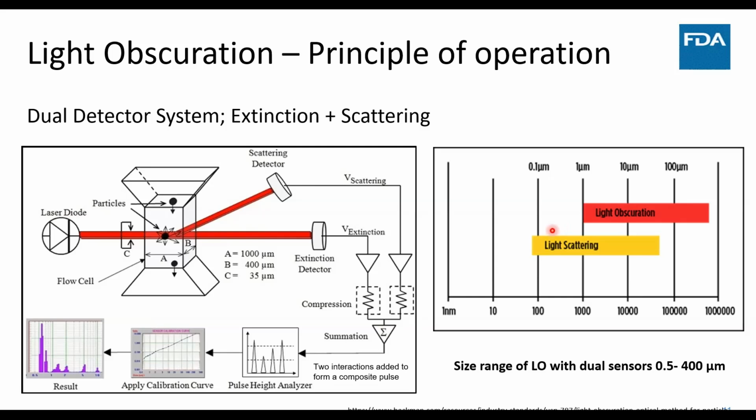Before we move on to the next slide, I want us to take a minute and really look at the configuration of the instrument and think about what could really go wrong with the instrument when it's being used. Usually, it's very easy to relate to results we get from an instrument where we really understand the basic principles of how the instrument operates. So we have a flow cell, where our particles are passing through. As a particle blocks our light source, we can get our count. And then based on the intensity or the pulse height, we get our results.